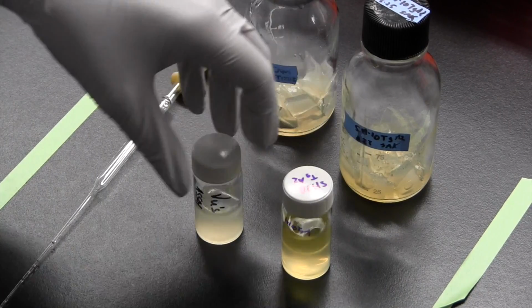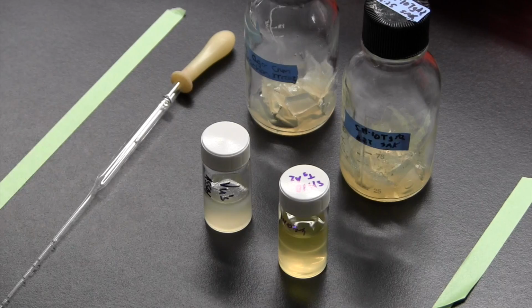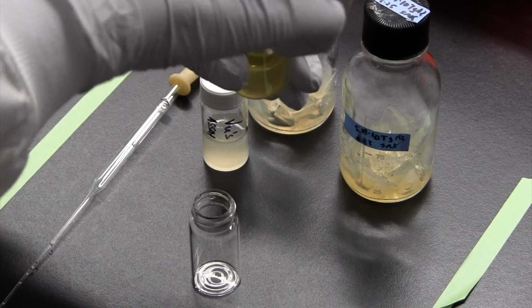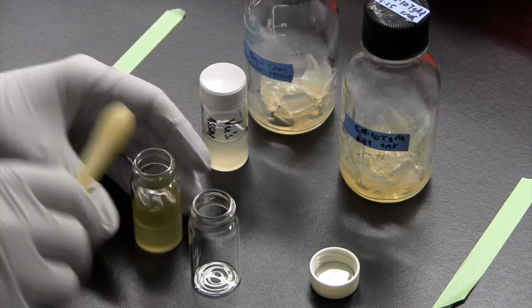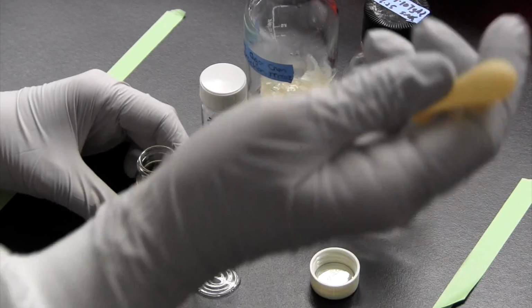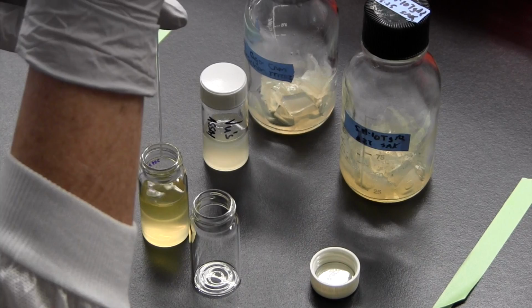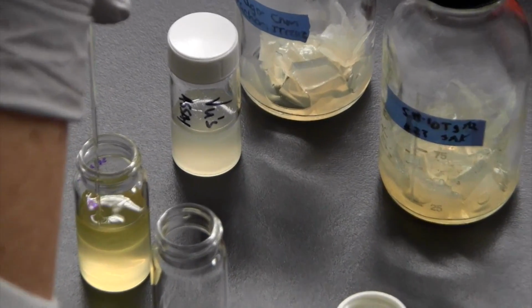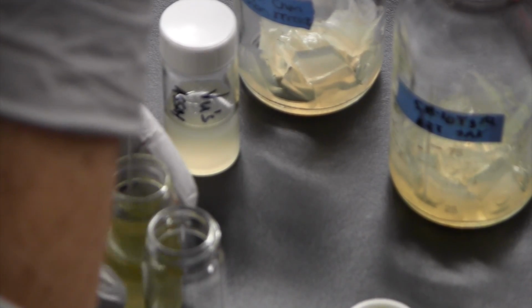So at this point, you're going to only be taking the top layer and putting that into a clean 20 ml scintillation vial. Okay? So again, using a clean glass pipette, you're going to draw off the layer, and you don't need to take the entire top layer. You want to try and not get that boundary between the two.